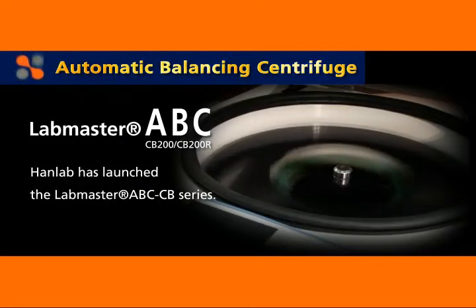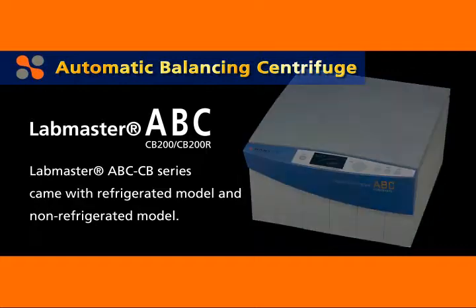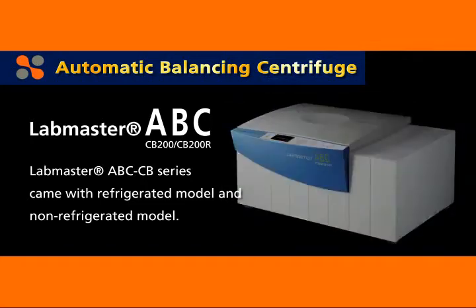HAN Lab has launched the LabMaster ABC-CV Series. They are compact, benchtop — also known as tabletop — automatic balancing centrifuges. The LabMaster ABC-CV Series comes with a refrigerated model and a non-refrigerated model.